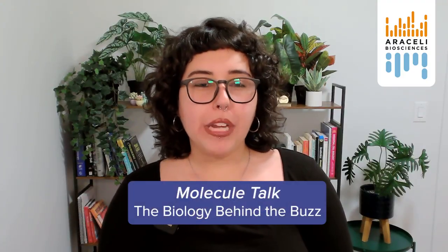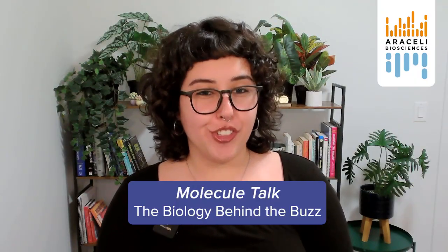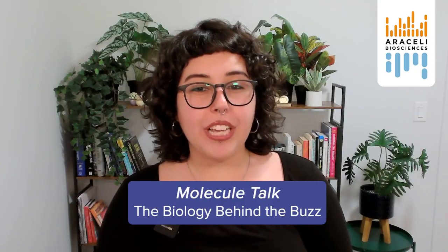I'm Carli Reyes, and our segment today is called Molecule Talk, where we break down specific papers, technologies, and ideas that are pushing biotech into the future. Today's episode is about something very fresh, a preprint posted in June 2025 called CellCLIP, Learning Perturbation Effects in Cell Painting via Text-Guided Contrastive Learning.